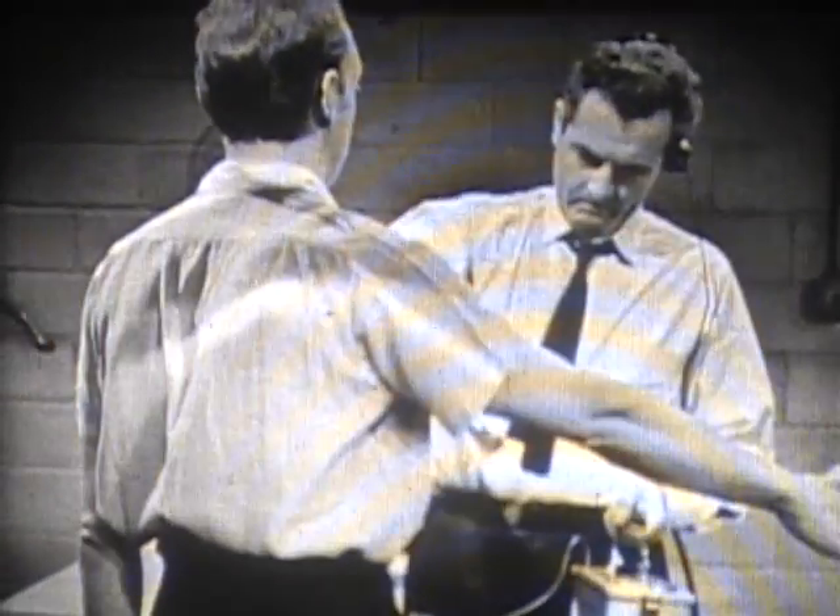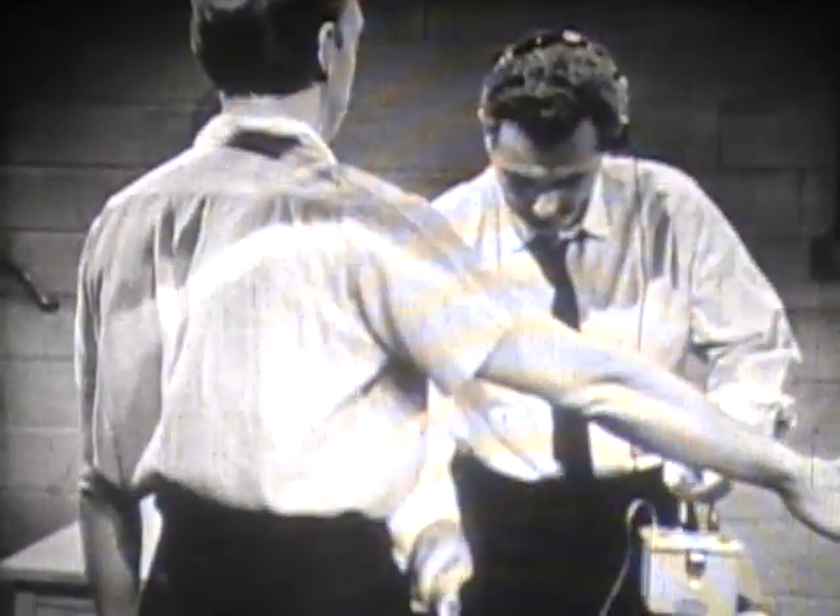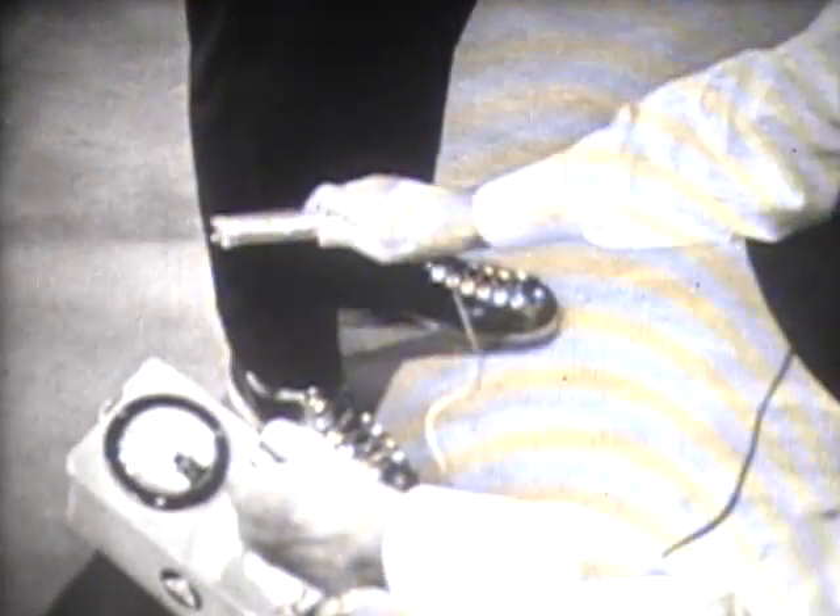The increase in frequency of the clicks above background indicates contamination in this area. The probe is then moved up the underside of the arm, down the side of the body, and the leg. Pay particular attention to the lower leg and shoes, since these are the most likely areas to be contaminated.